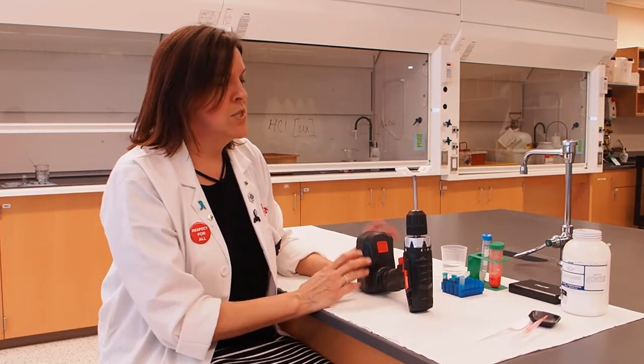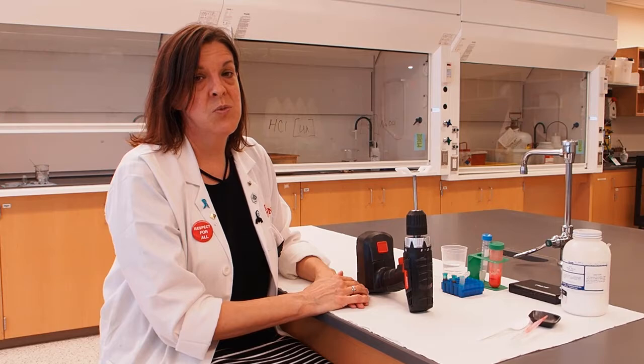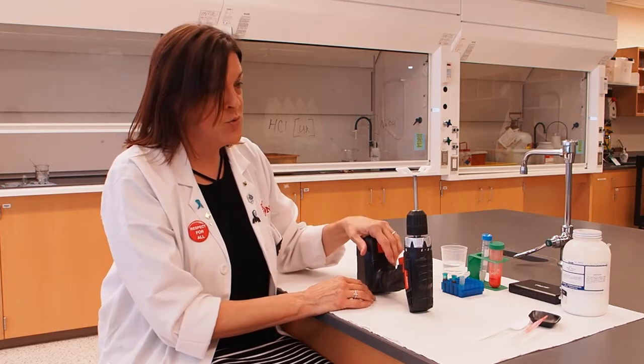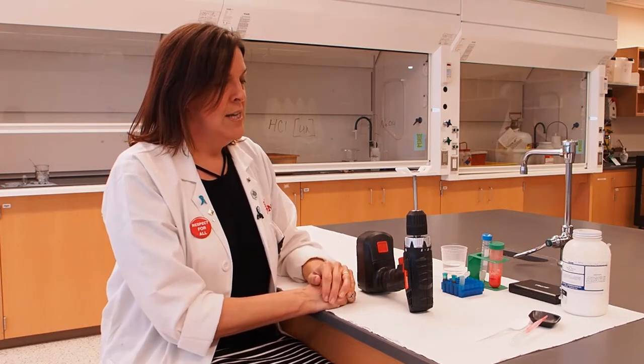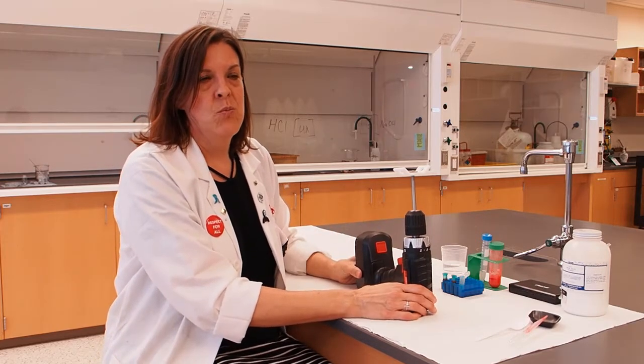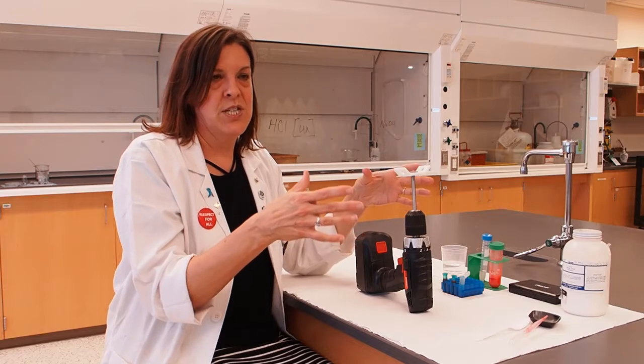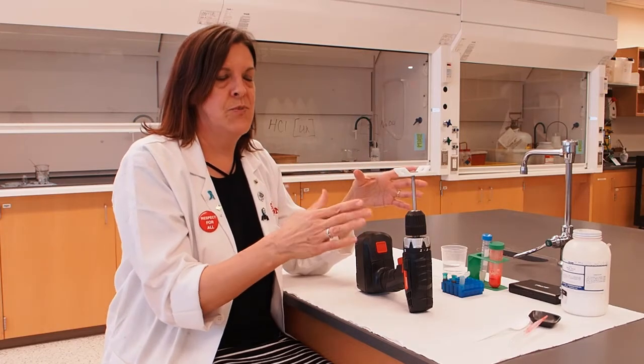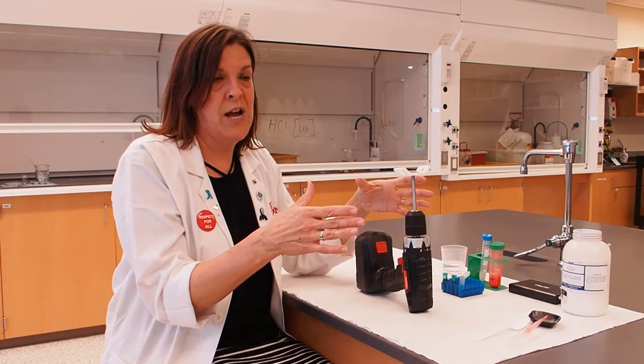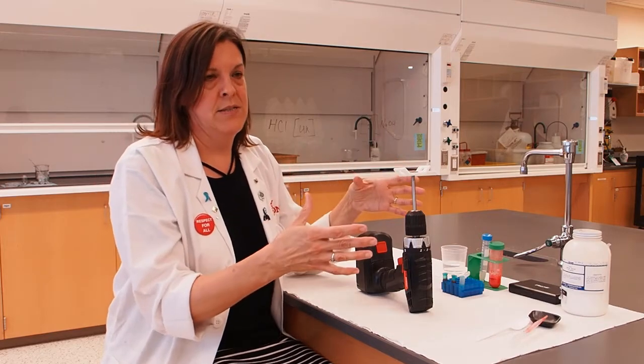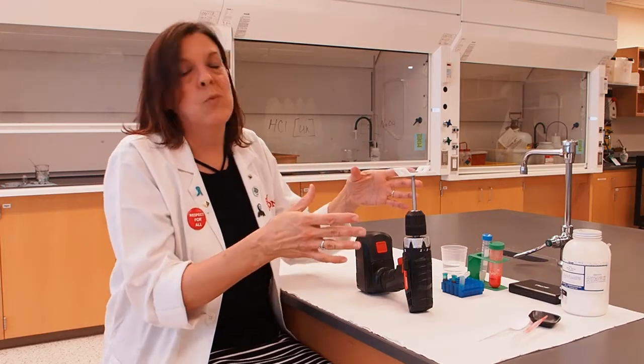Safety thing number two, which applies to all centrifuges, regardless of whether it's made from a drill or whether it's one you find in the lab, is that they need to be balanced. If you've ever watched a washing machine wash your clothes, when it gets to the spin part, you may see the washing machine vibrate back and forth. That's because the weight in the part of the washing machine that's spinning your clothes around to get the water out of them is what we call unbalanced. It means there's more weight on one side than the other.